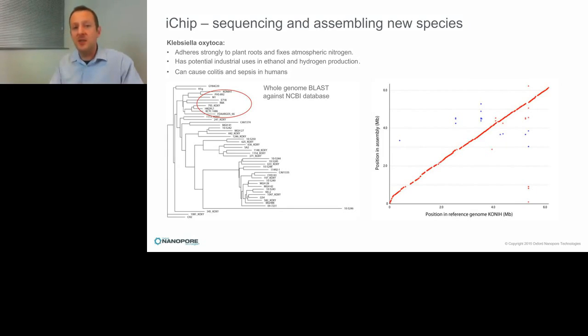So we're near to the end of this presentation, and I think it's worth summarising a few things here. That the MinION is a small, inexpensive, portable sensing device, which is capable of producing long reads of sequence information in real time. This lends itself particularly well to easy and inexpensive identification and discovery of microbial species. And when coupled with analyses that also work in real time, it becomes ideally suited to the real-time detection and characterization of microbial species, which we think will be perfect for things like infection control and monitoring food hygiene and safety. So what next?